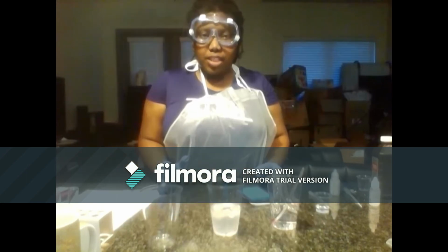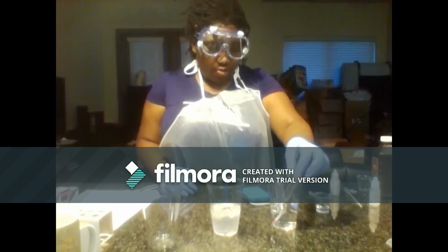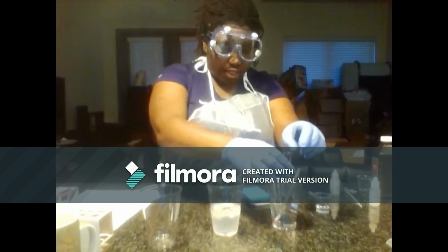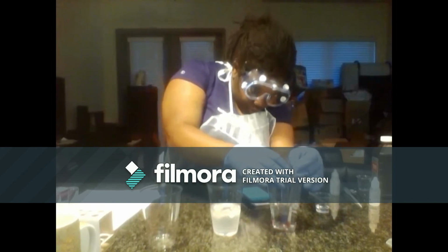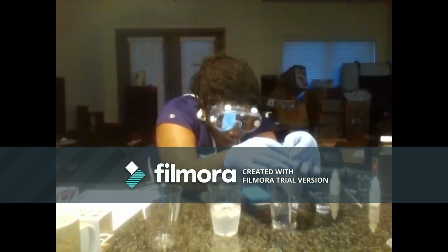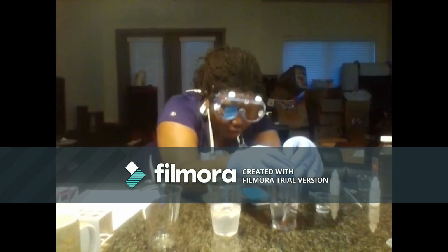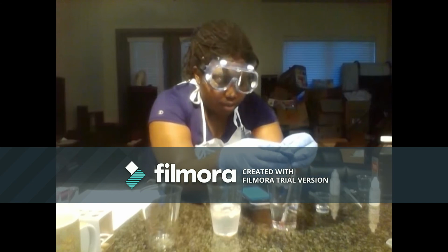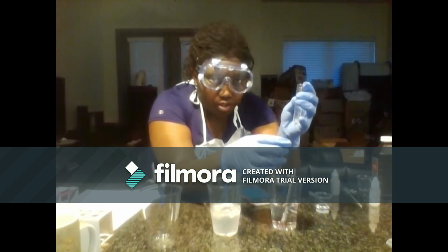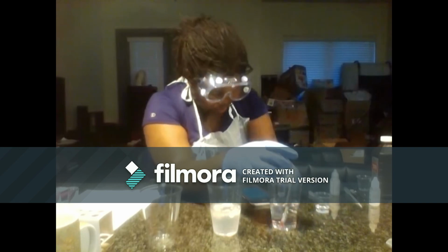Alright, so it's been 5 minutes, and both of my reaction tube and my peroxide have been sitting in this water bath at room temperature. My room temperature right now, I'm going to record it as 25.2 degrees Celsius. So I'm going to add the hydrogen peroxide to my reaction, and I'm going to start my timer.